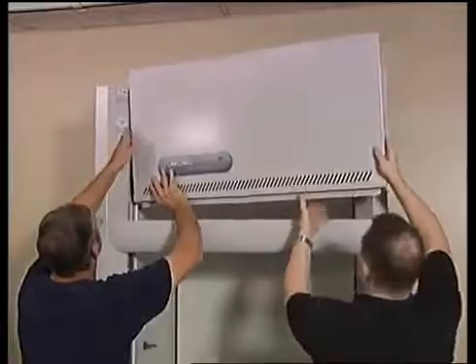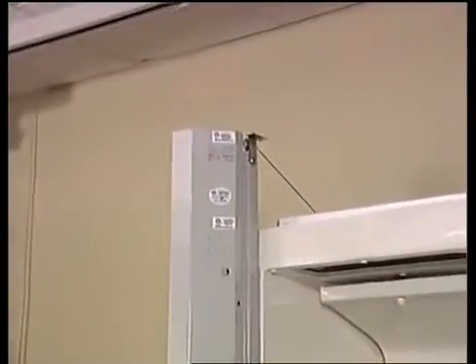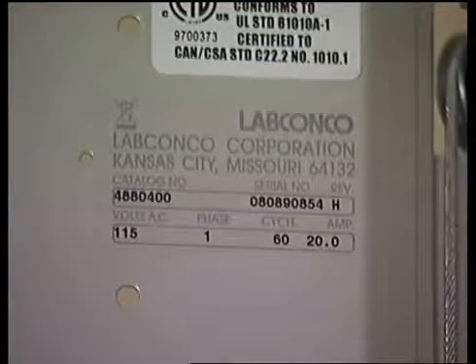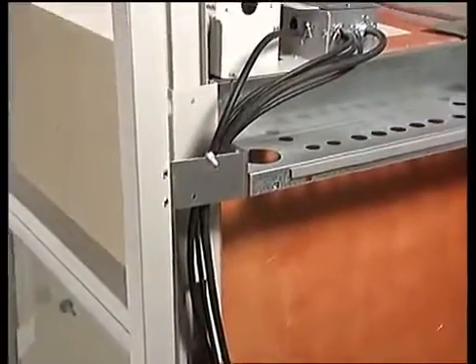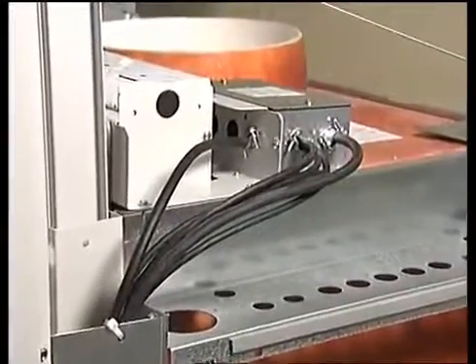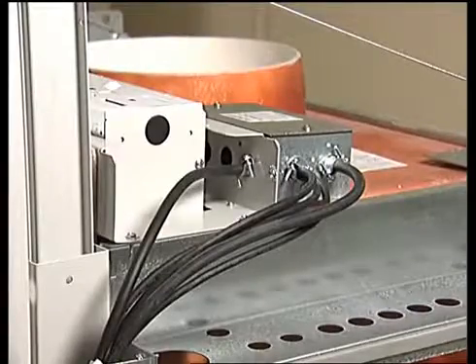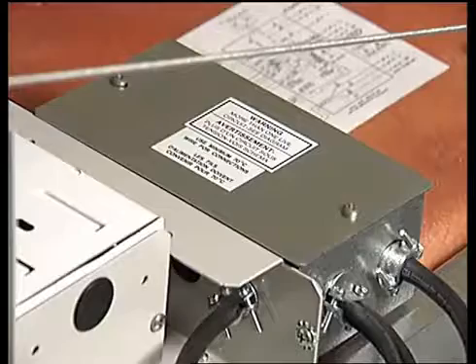Before making any electrical wiring connections to the hood, locate and refer to the identification plate for your hood's electrical specifications. Both the identification plate and the electrical boxes are accessible by removing the front panel. The electrical services can be routed from the utility space behind the base cabinet and directed through the service area up to the electrical boxes. An electrician should wire the hood according to local codes.